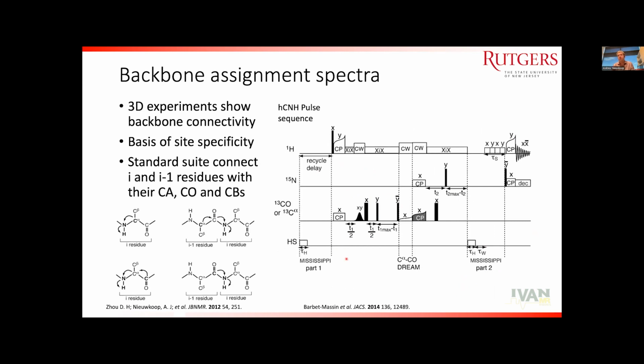Because it's an NMR audience, I get to show pulse sequences. I'll show you another one of these. There were 2 different successful strategies for this. One was developed by Chad while I was there. Another was being developed in Lyon by Guido Pintacuda and company, Lyndon Emsley. Basically in both cases you were starting on the proton and moving to the carbons, and then doing some sort of carbon-carbon mixing. The Lyon folks were mostly spinning at 60 kilohertz and doing J-based mixing here. We were spinning at 40 kilohertz and mostly doing dipolar-based mixing. The difference between those 2 is actually quite interesting, and I'll talk a little more about it later. Depending on your system, one of those might work better than the others, and it isn't always just how fast you're spinning. It sometimes depends on the dynamics within your system.